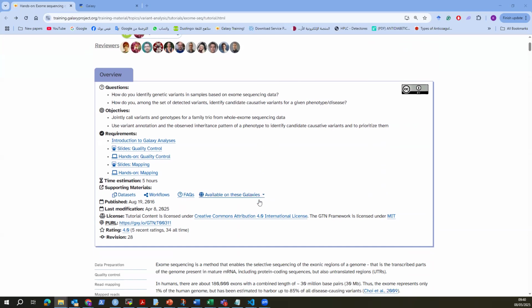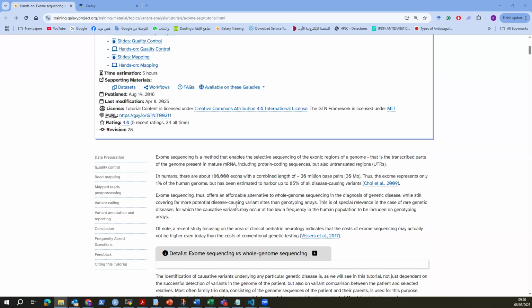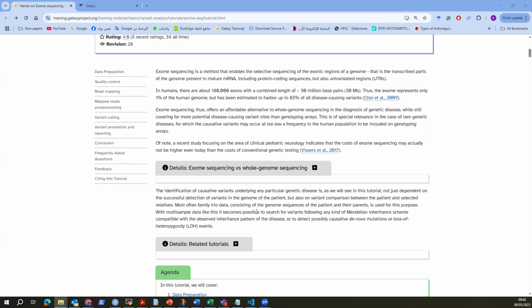the steps you need to take in order to detect structural variants from exome sequencing data, which is different from whole genome sequencing data, as we are targeting the regions responsible for translating into proteins. The reason we take this approach is the cost efficiency of sequencing only the regions responsible for protein translation, so we reduce the cost of sequencing the whole region of the DNA.